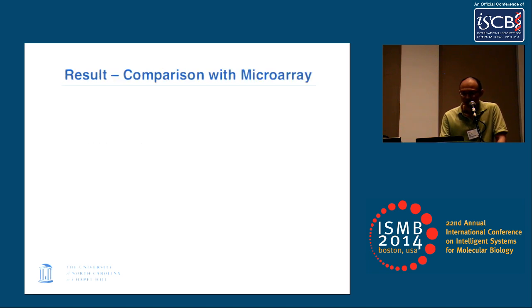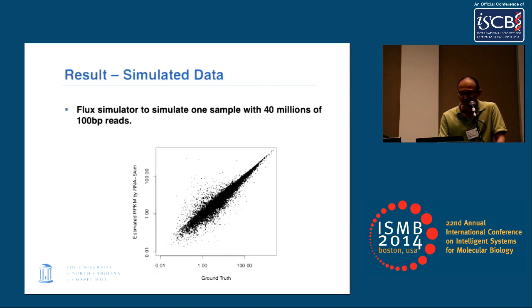Sure. So I think low abundance transcripts are very hard to solve, and even if you want to use alignment-dependent methods to align the reads, we only observe a few alignments to the low abundance transcripts, which makes it really hard to solve. But this plot here shows that even for the low abundance transcripts, we still perform reasonably well. And from the overall correlation scores, we think we are doing just as fine as the other methods.